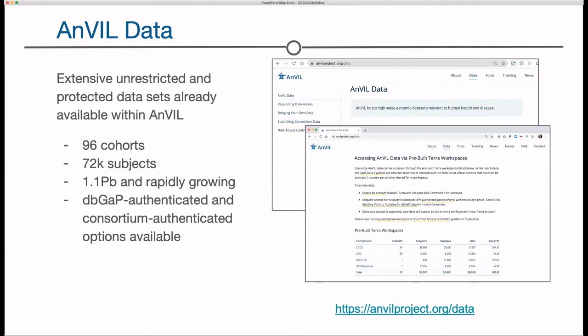Which really begs the question, how are we going to do analysis over hundreds of thousands of genomes? If we're going to do this in a cloud environment, the meter is always running. Some of these workflows cost tens of thousands or hundreds of thousands of dollars to do one analysis. So anything we can do to make this more efficient, in both space and time, is going to be a huge win for genomics in a very practical sense. Furthermore, it's going to let us do analysis that's never been done before as we can scale into larger and larger data sets.